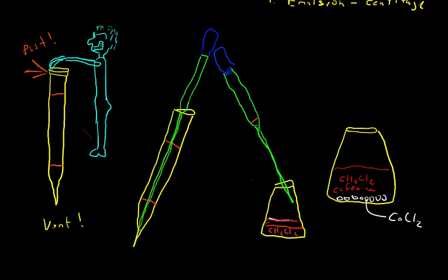If at any point you have to stop after you've removed the dichloromethane from the tea, once you've gotten to this point right here, it's a good idea to just seal this up with parafilm and keep it in your drawer, or I can keep it in a fume hood somewhere. That might be a better idea because we don't want these fumes going off into the lab. Often what will happen, because dichloromethane has such a high vapor pressure, it'll just go ahead and evaporate. And what you'll see here then is crystals inside this flask. Those crystals are caffeine.